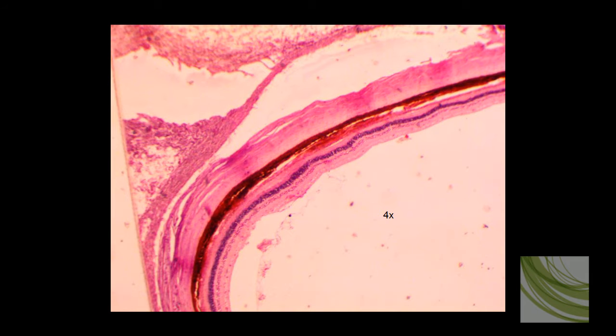This is a slide of a cat eyeball. Here is the slide of the cat eyeball using the 4x objective, and in this part of the slide we're actually looking at the retina and the choroid layer and the sclera.